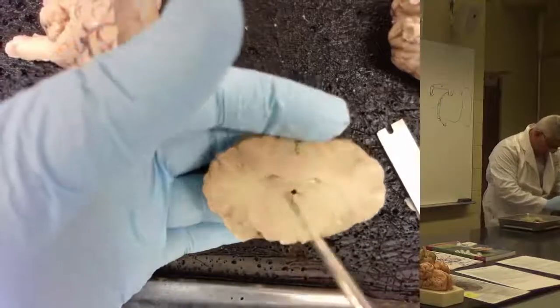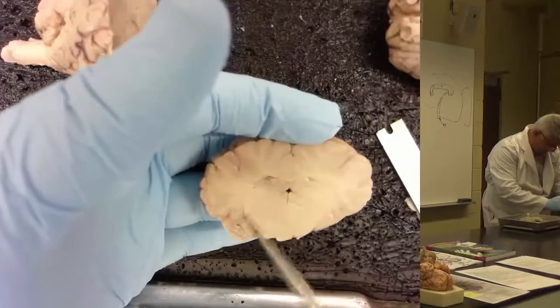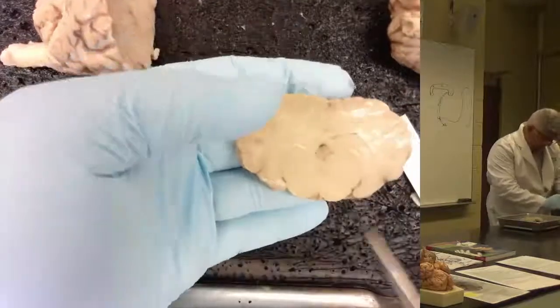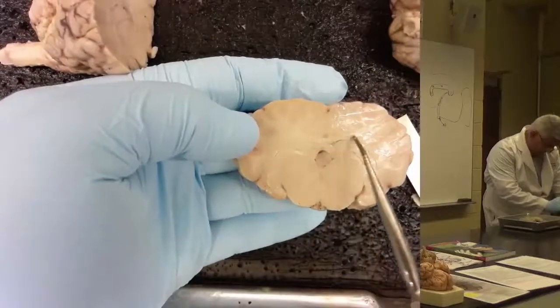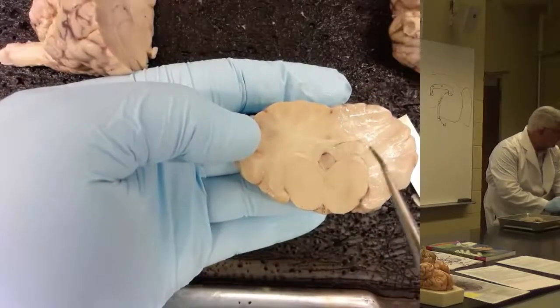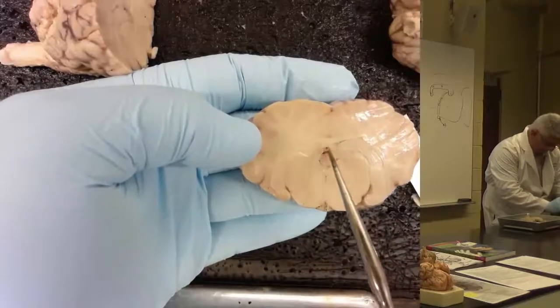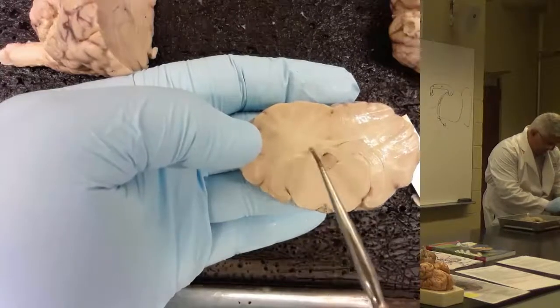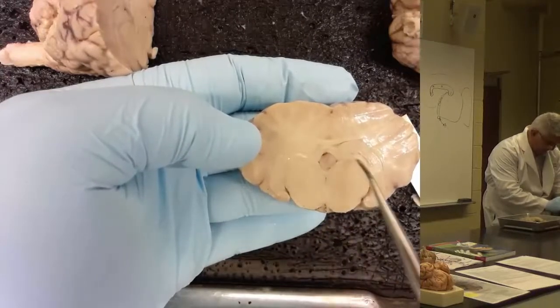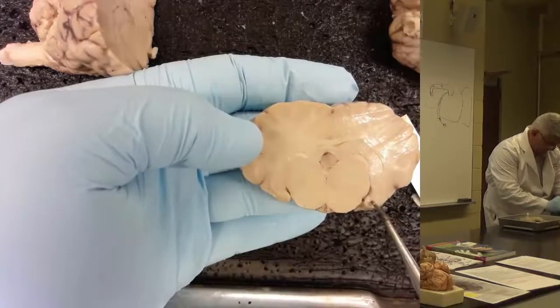Again, this is going further back, and you can see how this wraps around. The fornix is dying out and wrapping around. Now, you can really see it here. So this is what used to be the fornix. See, here's the corpus callosum. You guys see that? Is it white? Yes, the corpus callosum is white. The fornix here is white, but it's turned into this gyrus that wraps around and has become the hippocampus over here. See how it wraps around?